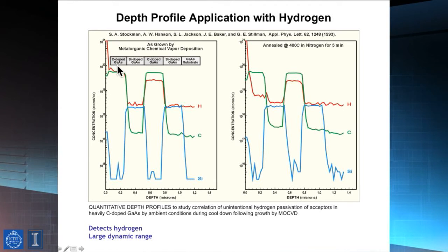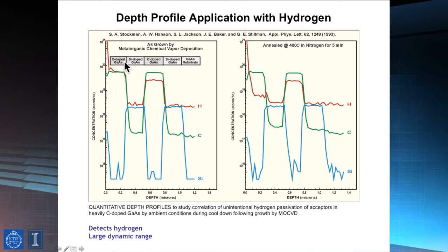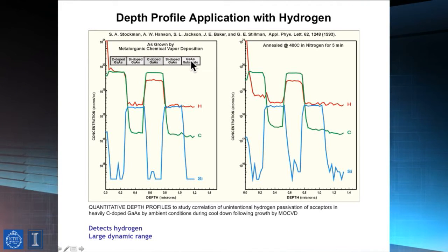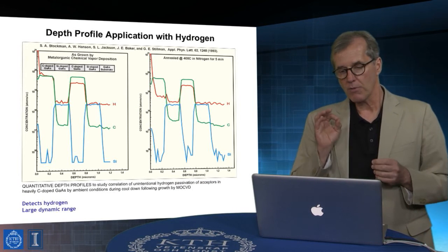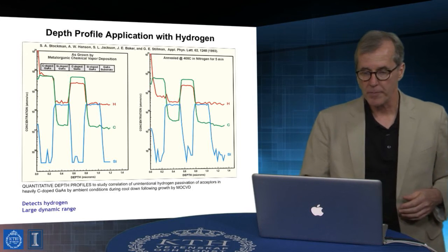And this is gallium arsenide in each case, but gallium arsenide with different kinds of dopants. So these layers are modulated with dopant atoms. They're dilute compositional impurities which modulate the electronic structure in spatial extent based on the inclusion of either carbon or silicon based impurities, which are deliberately put in with very precise concentrations in substitutional form, right?